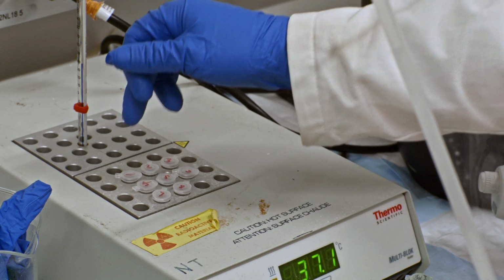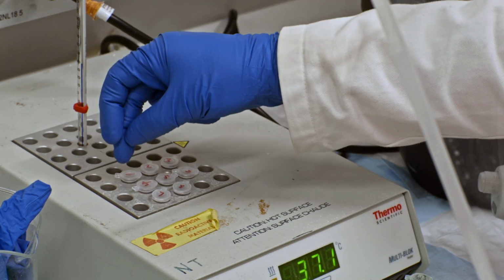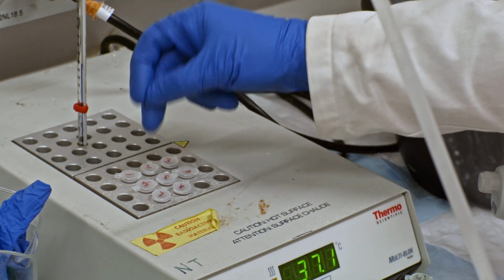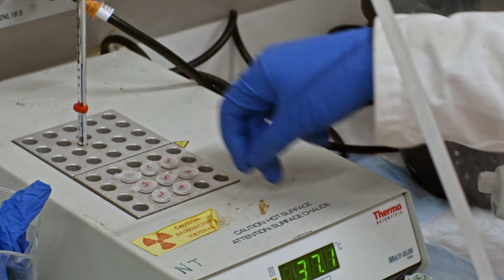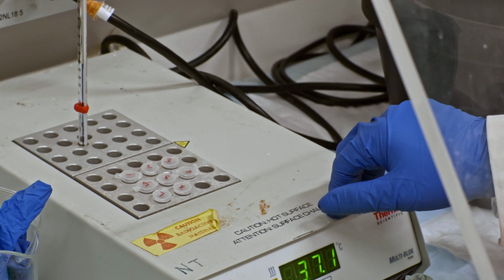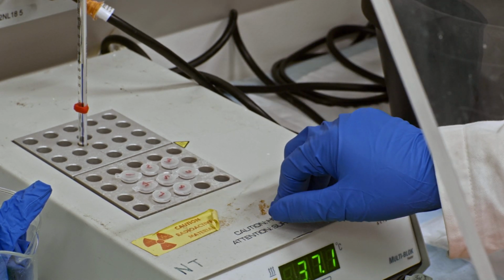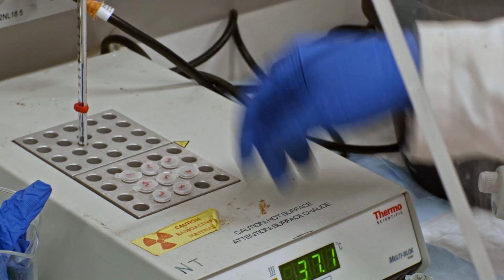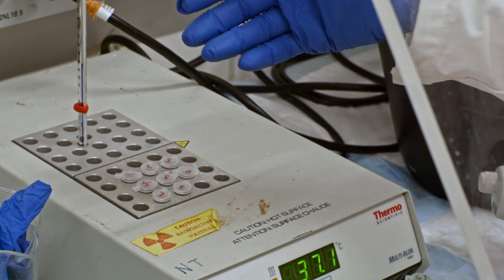I did 30-second intervals, so whenever I added dNTPs, I added it to reaction vessel 1 at 30 seconds, then at a minute, minute 30, 2 minutes, 2 minutes and 30 seconds, and so on and so forth until I filled all of these reaction vessels. Now, my first reaction vessel time point will be at 5 minutes and 30 seconds, because if I'm taking a 5-minute time point, if I started this reaction vessel at 30 seconds, 5 minutes later would be 5 minutes and 30 seconds.